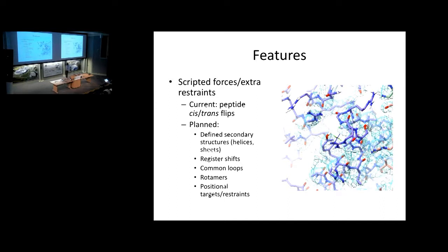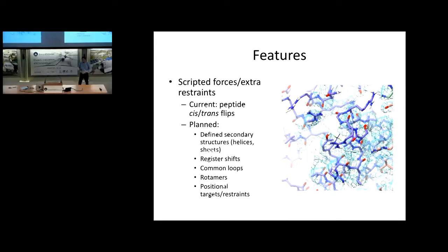So similar applications of that, some of which I have previously implemented and just need to re-implement in this new environment, is dial-up a rotamer. You pick a residue, see a preview of what the rotamer will look like, but don't actually commit it yet. You commit it if it's not clashing with anything, but often you have the case where your new rotamer is going to be overlapping with something else that's also wrong. In that case, you can just set that as a target and then have the simulation go there and have everything adapt to it as it goes.